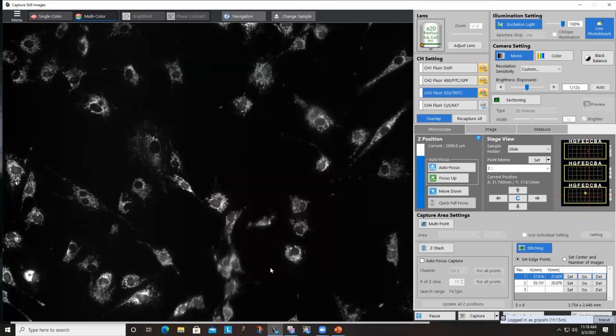Now let's put colors to this and see what happens. So let's say I put colors to this, guys, and let's keep it the way it is. Okay, and I hit capture.